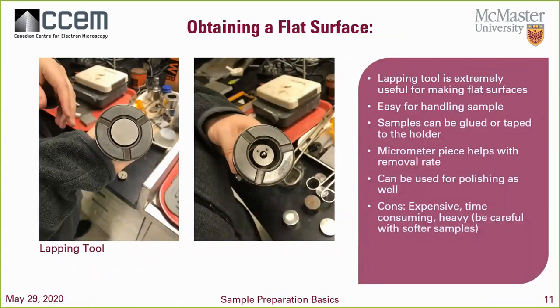Now, another topic I want to push to you very quickly is obtaining a flat surface. It is extremely important to have a flat surface, especially when you're dealing with electron microscopy. There is a tool called the lapping tool. This tool allows us to create a flat surface by mounting a sample right on this plate. It is very easy to mount. You just need a piece of tape, or you can use wax on a hot plate.